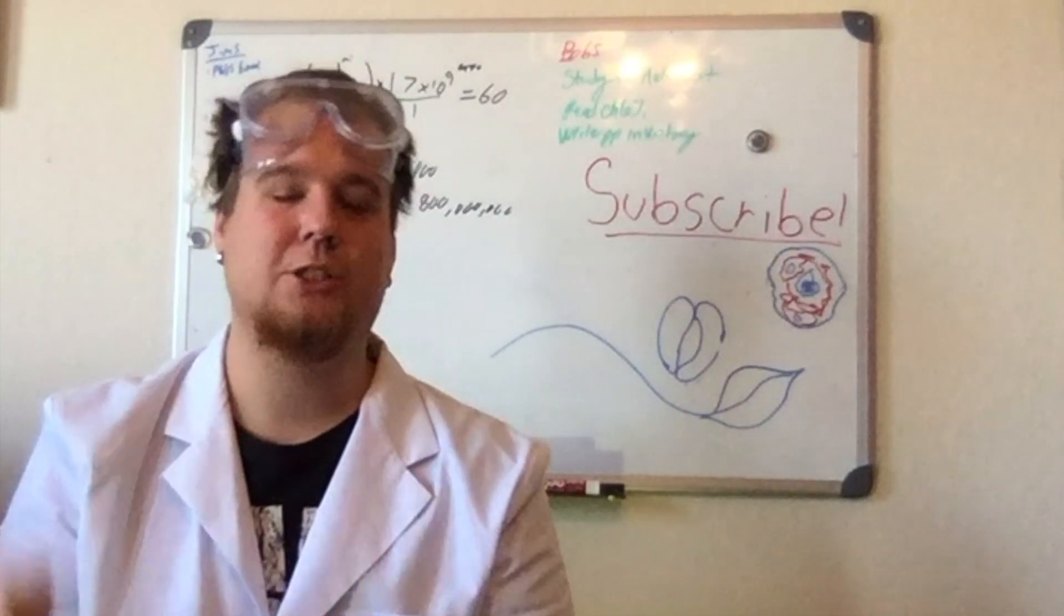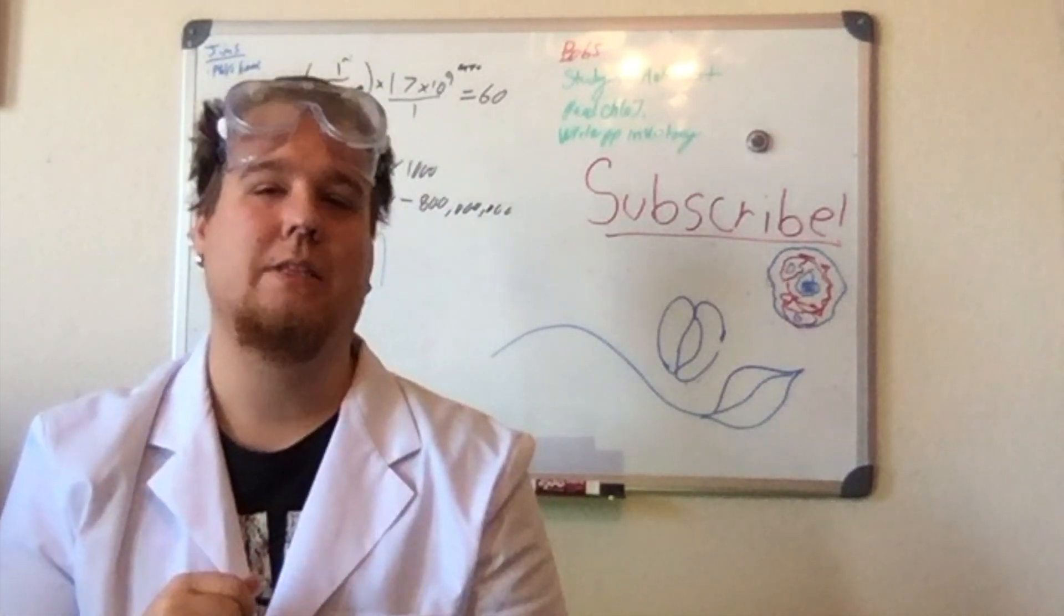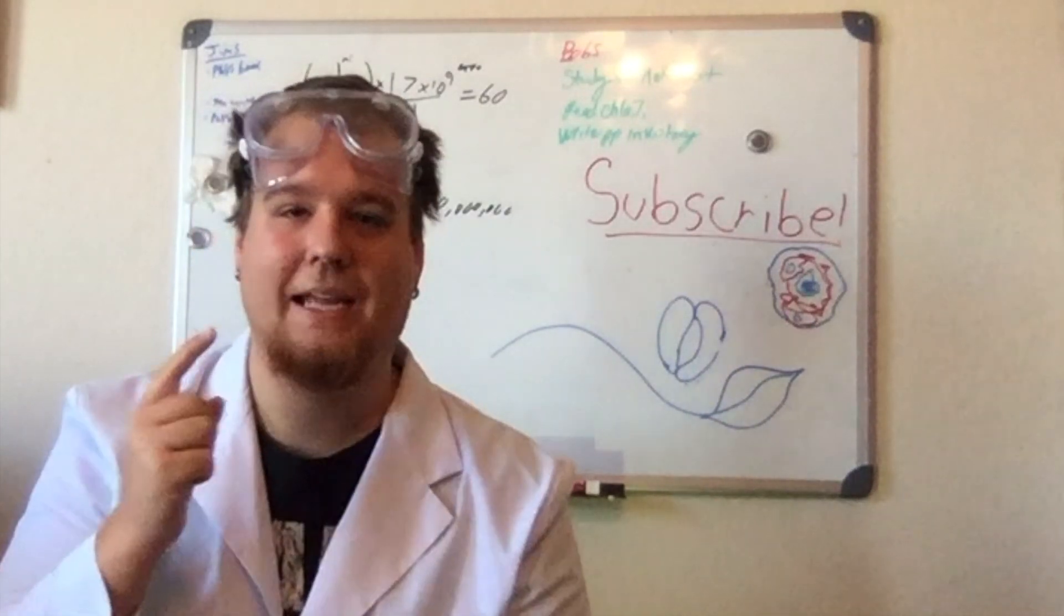Hey everybody, welcome to my fictitious laboratory where today we're going to be talking about what is essentially a bunch of little plant mouths.